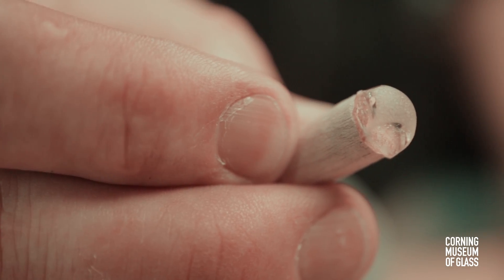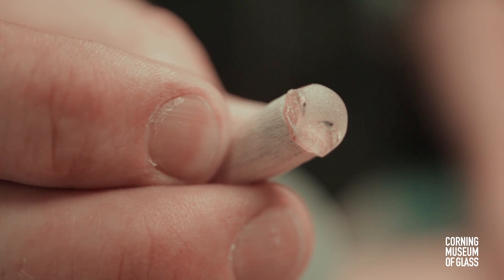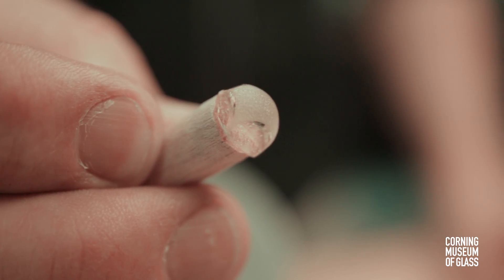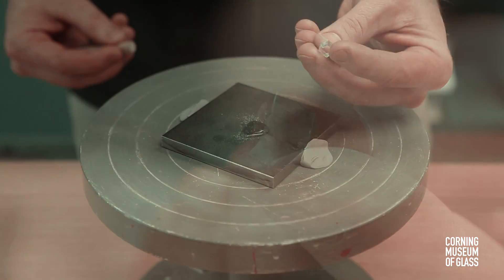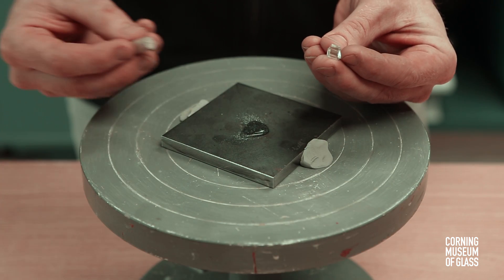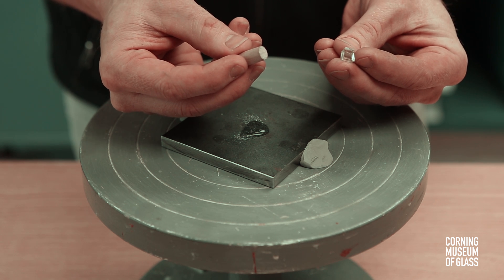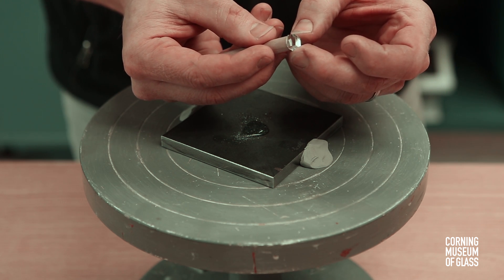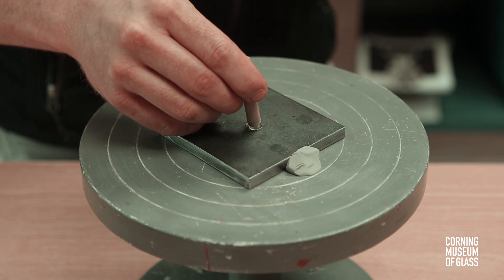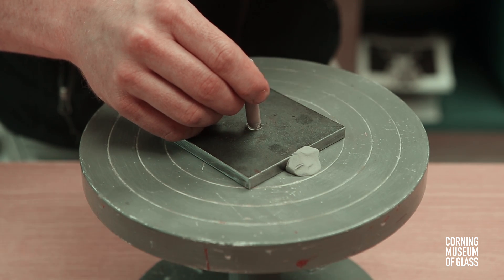Van Leeuwenhoek's most common method for making microscope lenses involved grinding and polishing tiny pieces of colorless glass. He used resin or glue to attach a glass shard onto a stick. Grinding the glass shapes it to match the curvature of a mold.